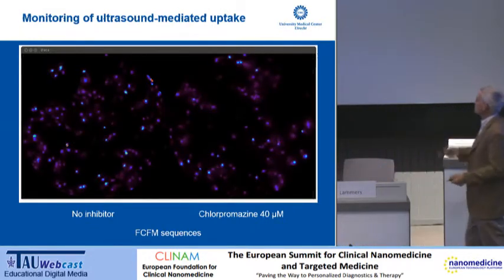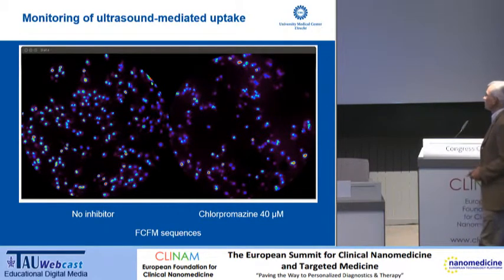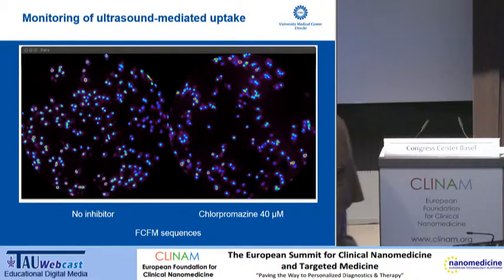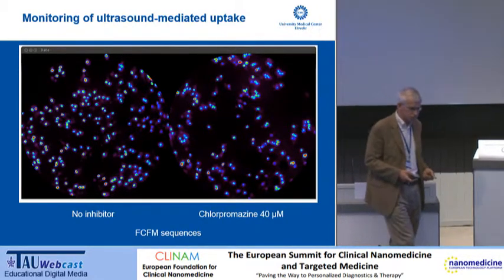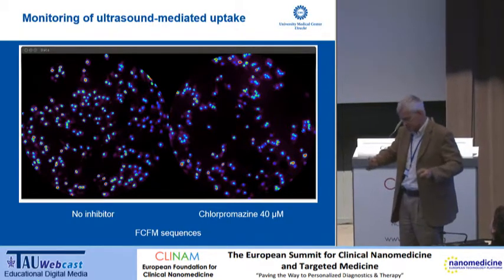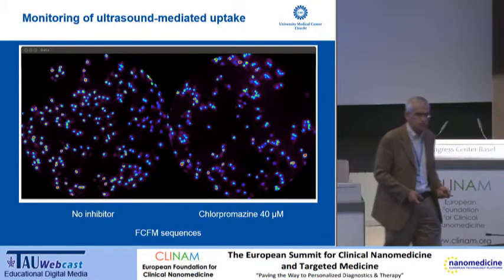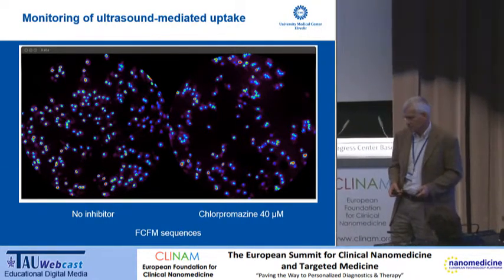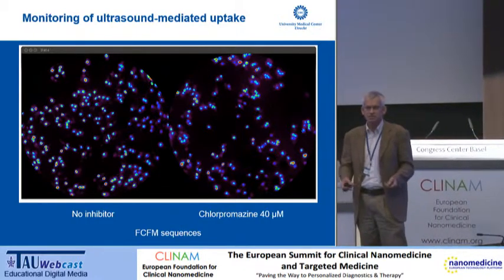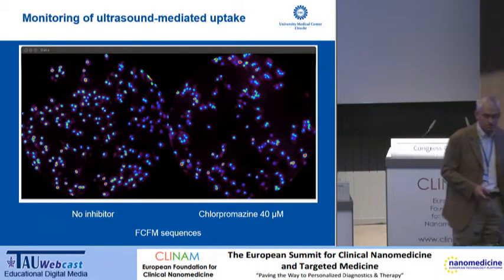So here, as you see, individual cells are measured with fibered optics, measuring each individual cell. You can see these cells highlighting after an ultrasound treatment in the presence of microbubbles. These microbubbles push against the cells, and as a result they take up a compound. We use it as a model drug: SYTOX Green, or one of the other compounds that have no fluorescence when they are not together with nucleic acids, but their fluorescence increases more than 100-fold when they intercalate with nucleic acids. And that's what you see here.